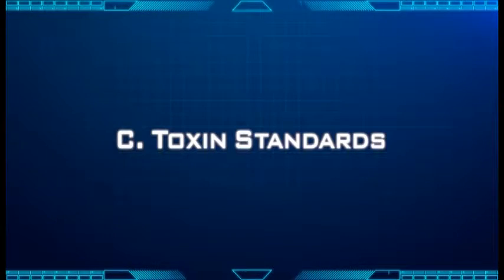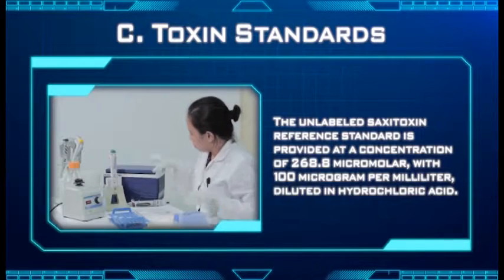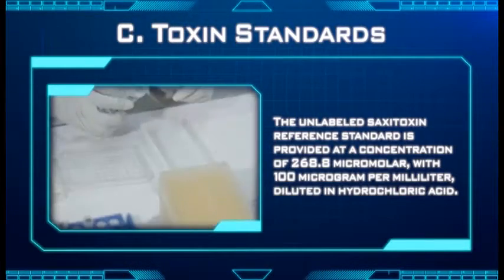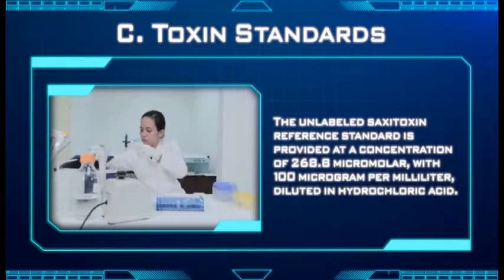C. Toxin standards. The unlabeled saxitoxin reference standard is provided at a concentration of 268.8 micromolar with 100 microgram per milliliter diluted in hydrochloric acid.